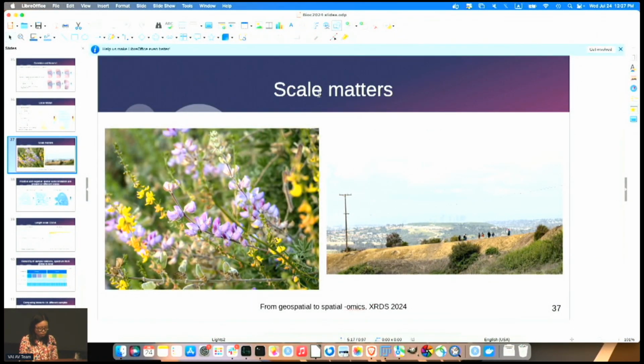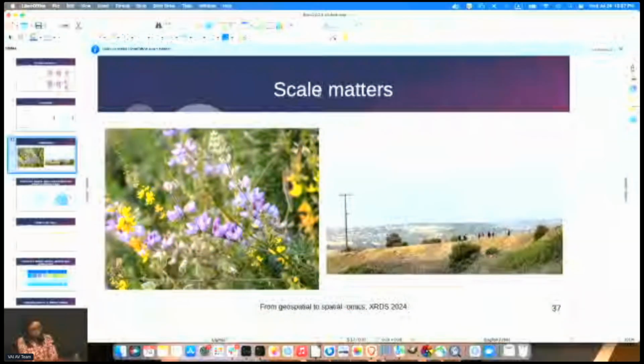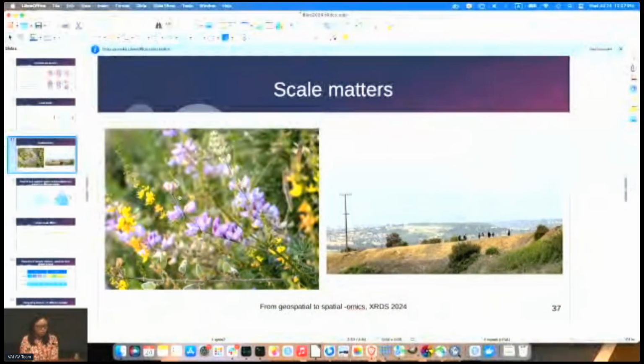When you have the spatial neighborhood graph at single cell resolution, like in Xenium and MERFISH, it means something different from Visium, where each spot has many cells, because at different scales there can be different spatial phenomena. Like in geographical space, the phenomena at the level of wildflowers will be very different from those at the level of landscapes.